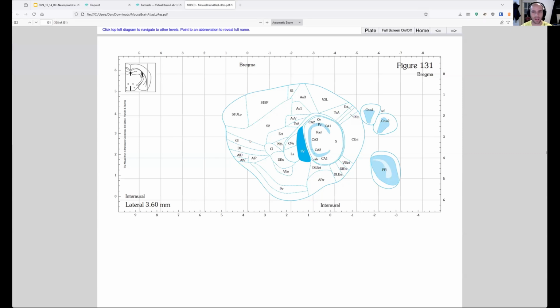So it's a little more work, but I hope that it's kind of fun and interesting to try both of these two ways and see why we built Pinpoint in the first place.